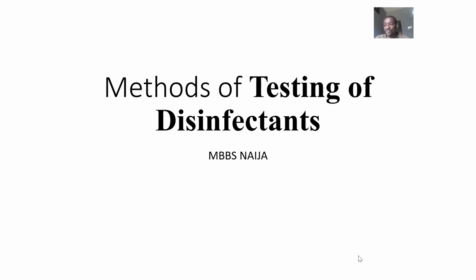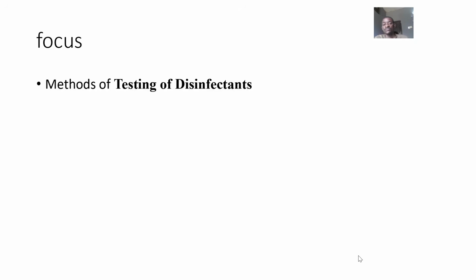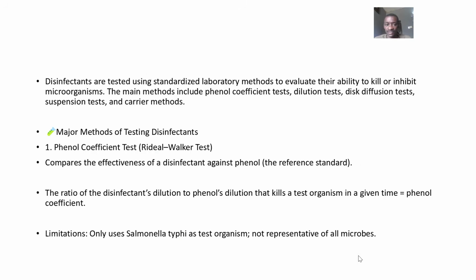Talking about methods of testing disinfectants. So if I have a disinfectant, I don't just go and start using it anyhow. Do you understand? I'll actually have to test that disinfectant. I test it very well to make sure that the disinfectant is actually effective. And I'm also testing because I want to know the amount of that disinfectant that will be effective. Alright? So, methods of testing disinfectants.